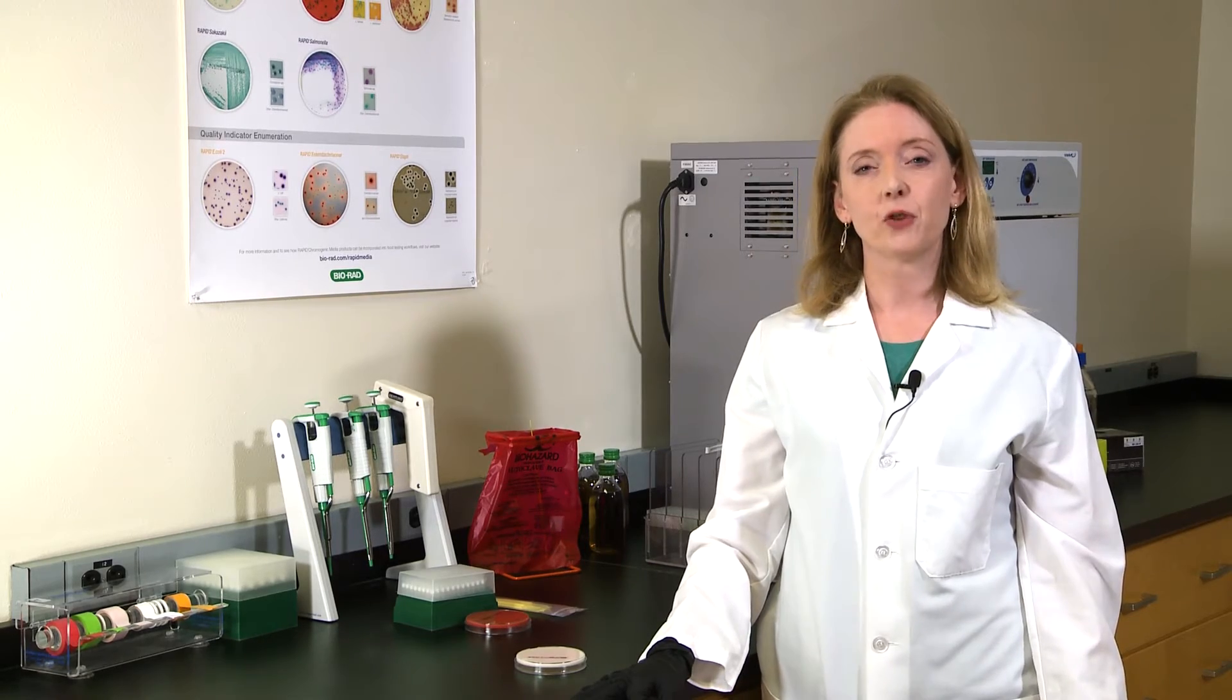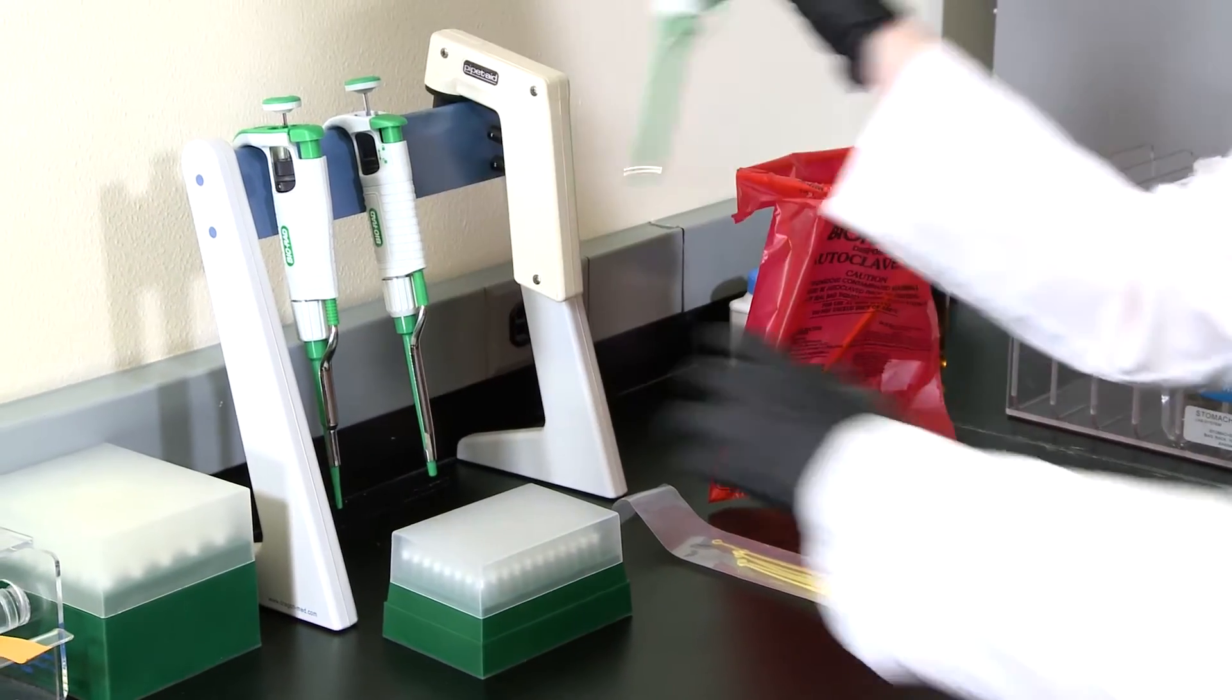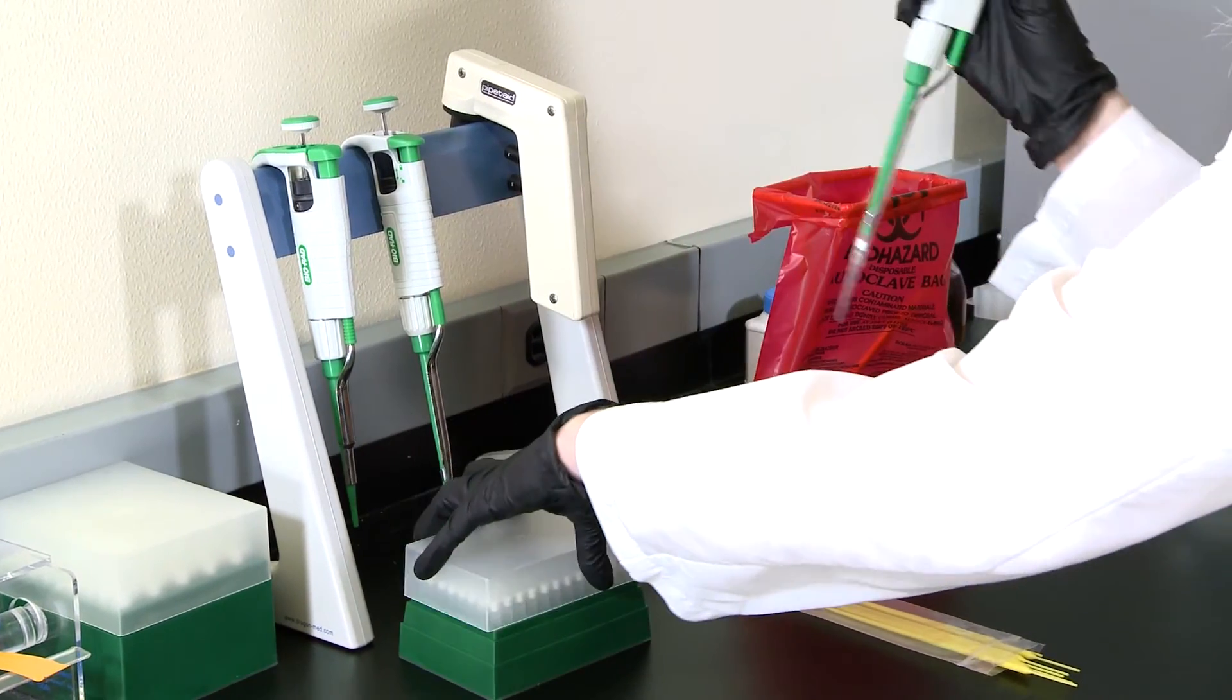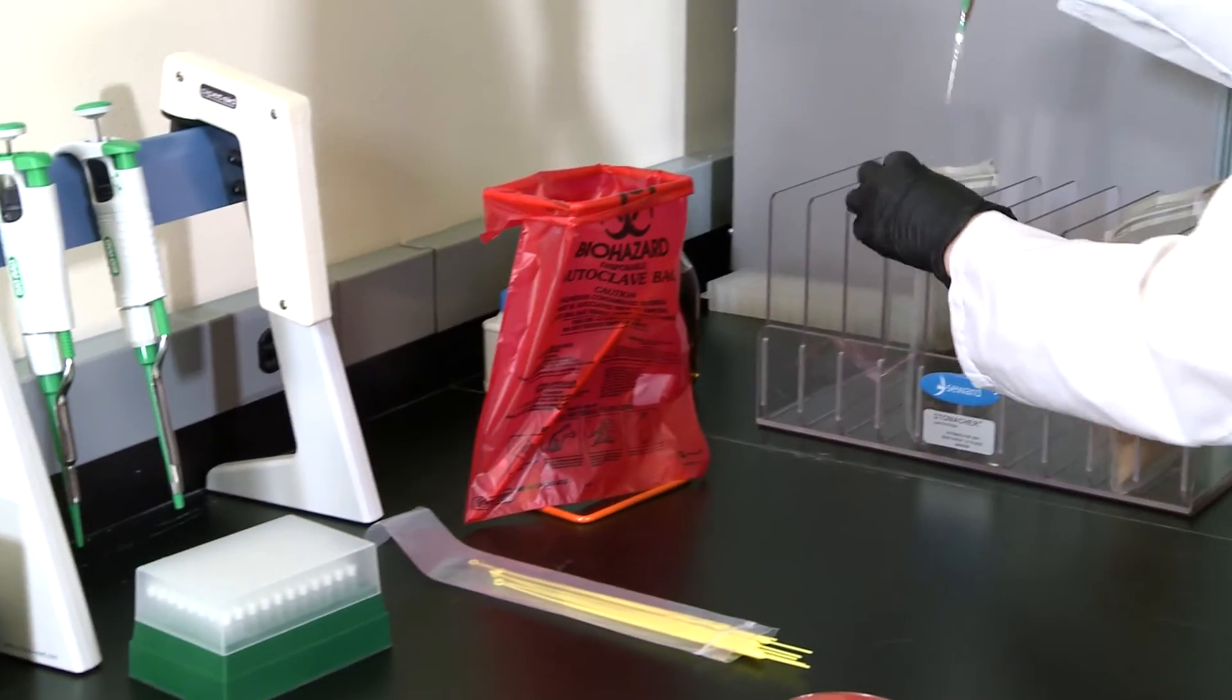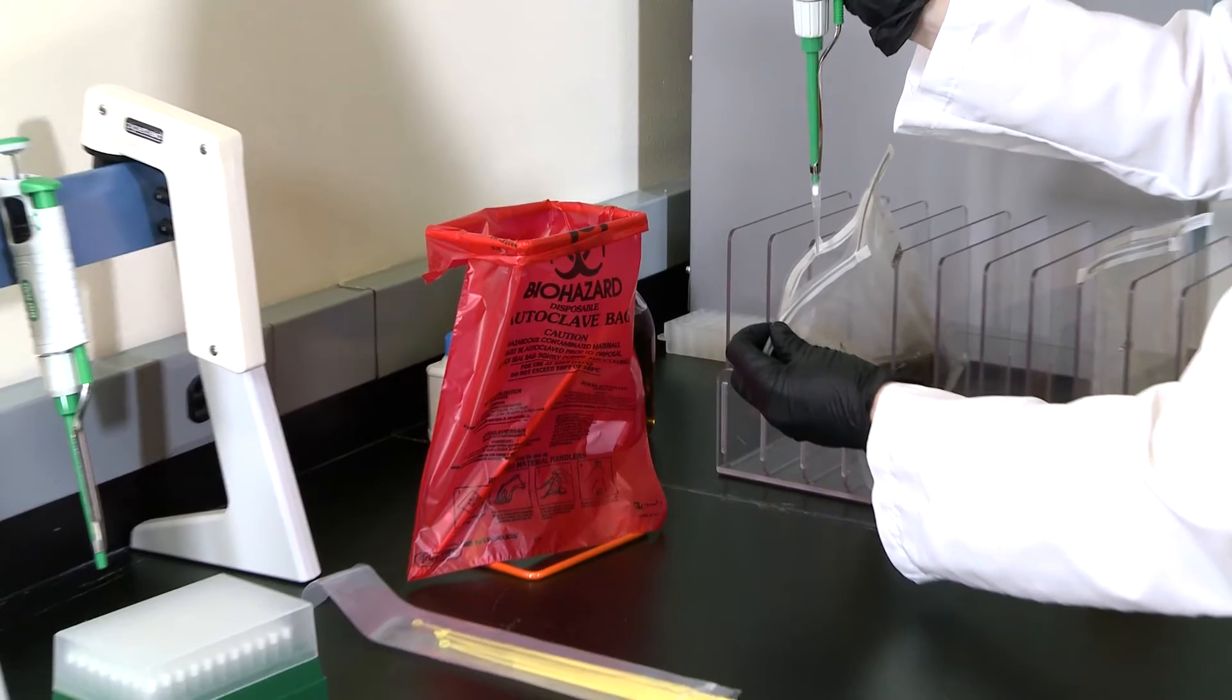Now we will move on to the protocol for listeria agars. Today we will be using rapid L mono as an example but the streaking protocol is the same for rapid listeria species and AL agar Ottavani and Agosti formula. We've already enriched our sample and we will take 100 microliters using a pipette and place it on the outside edge of the plate.